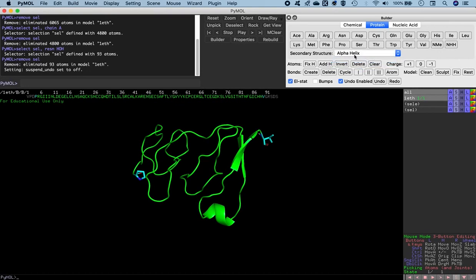So if you select alpha helix, then it will basically create a helical kind of secondary structure for these regions that we will build on top of the existing N and C terminals. We don't want that. So a beta sheet is a more acceptable format because you don't have a format for a loop region out here. They don't give you the option for reconstructing it as a loop region. So the safe bet out here would be the beta sheet in the anti-parallel orientation.